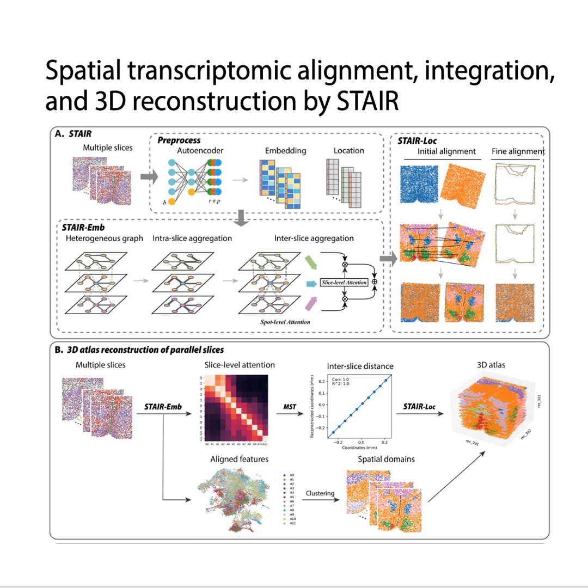Let's move to the clinical relevance. Specifically, the HER2 positive breast cancer case study. This involved 3 consecutive slices. What new critical biological knowledge came out of seeing this in 3D? This is where the 3D vision truly shines. STAIR identified 8 distinct spatial regions within the tumor, distinguishing areas that other methods had just lumped together.